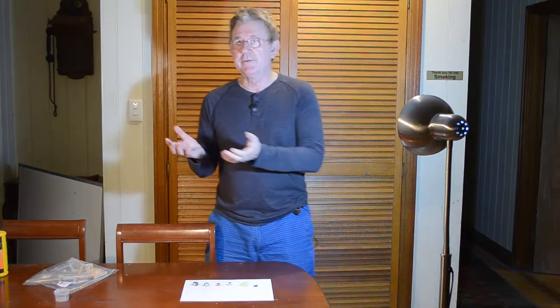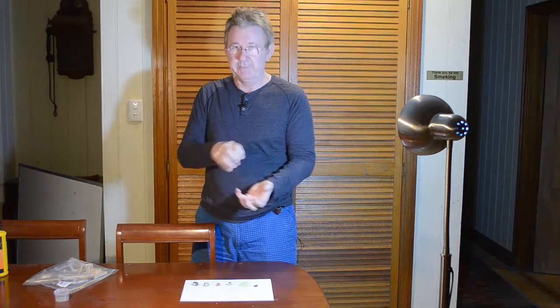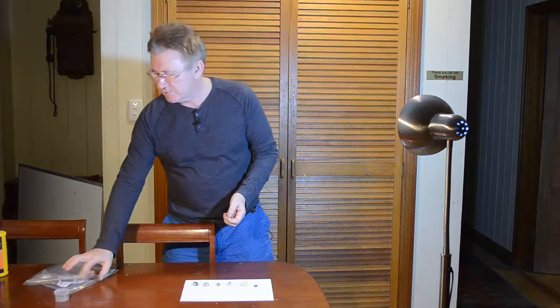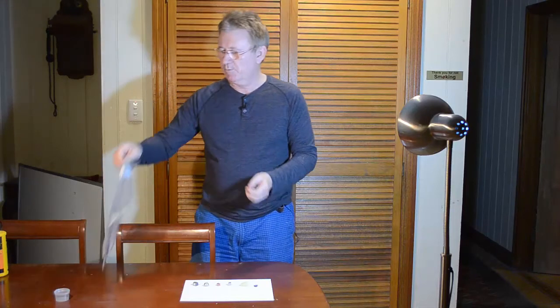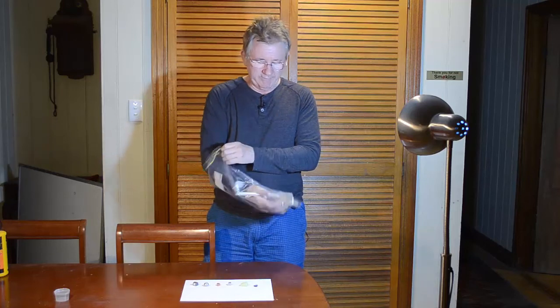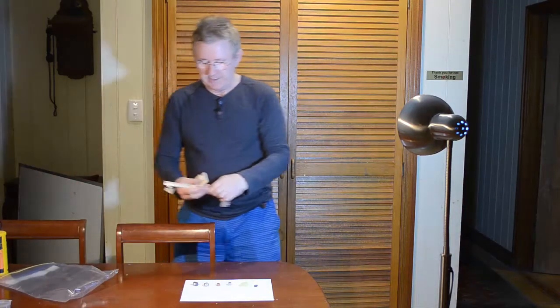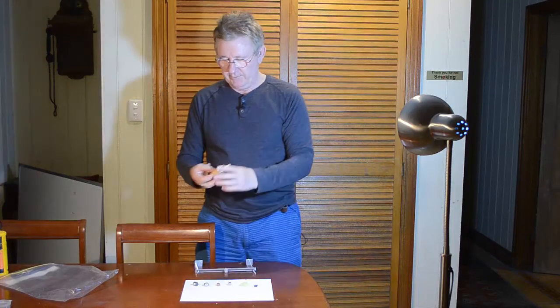Now they can do that with a mass balance, like actually weigh the number of grams of each of those, or they can also do it with a beam balance, which is what we've made here. And this is one of the earliest kinds of ways of measuring masses in science. It consists of 3 bits here.